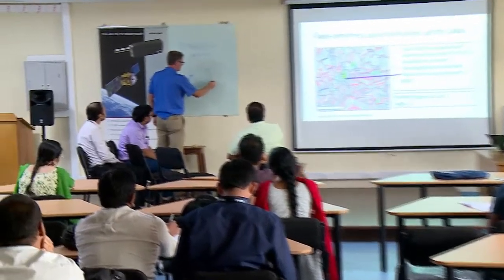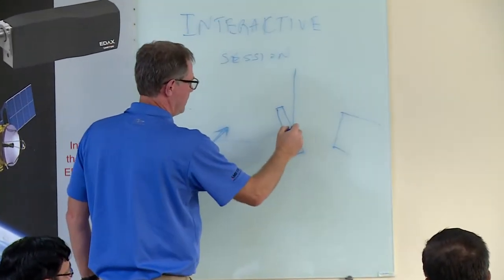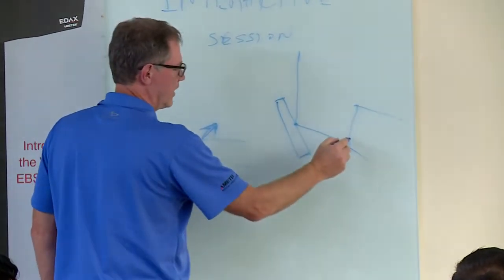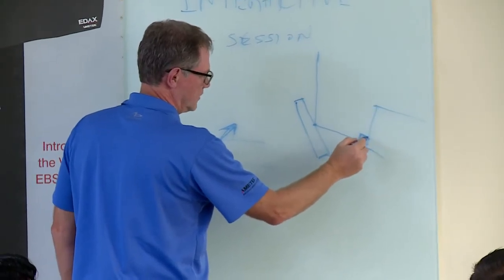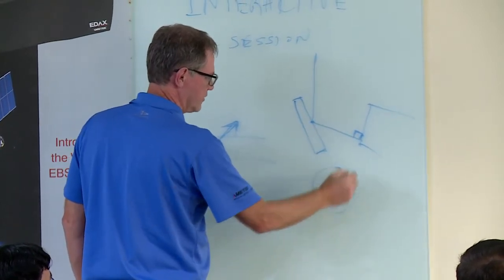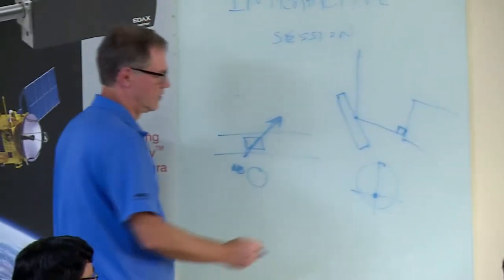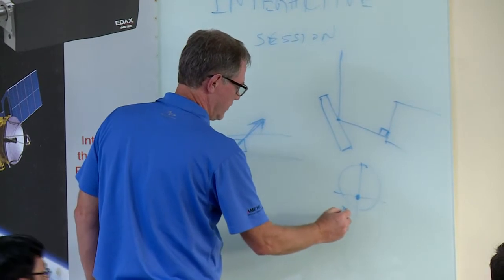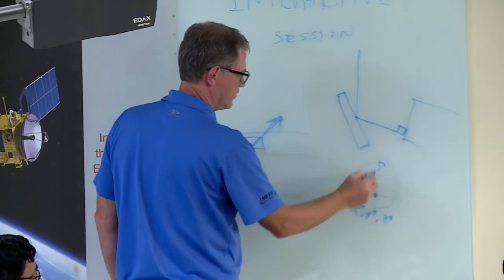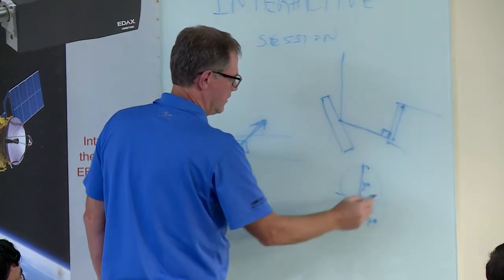So there's something called the pattern center. The idea here is that the beam hits the sample here, and it comes over here to the detector, and you take the normal to the detector to there, and that becomes what we call the pattern center. So in 2D then, the pattern center would be right there. And so we call this point X star, Y star, Z star. Z star is this distance. This is Y star, which is right here, and X star.